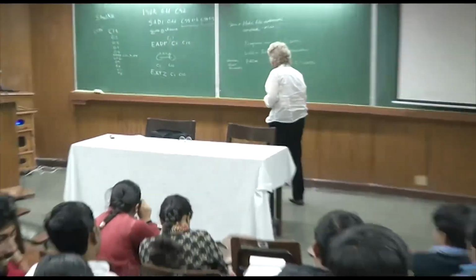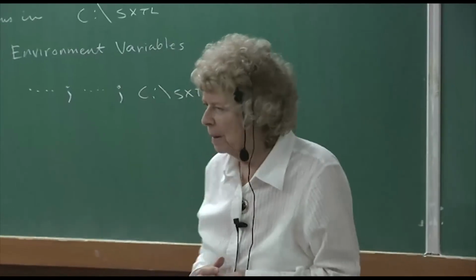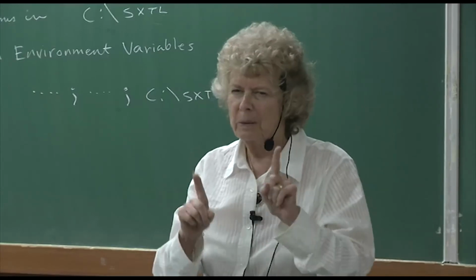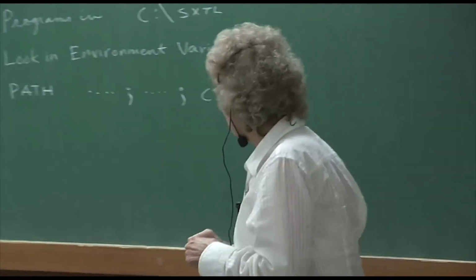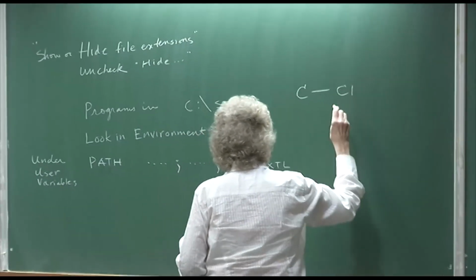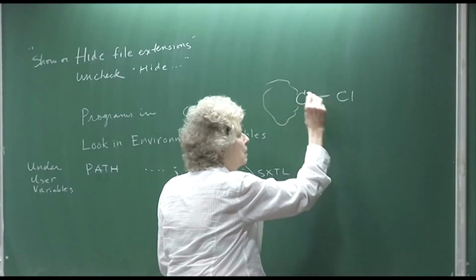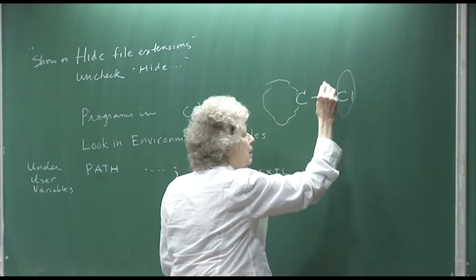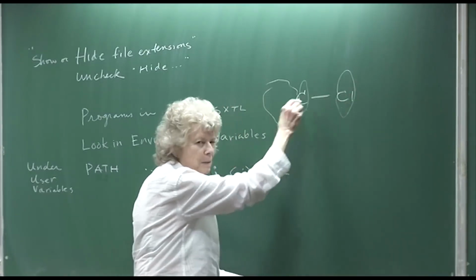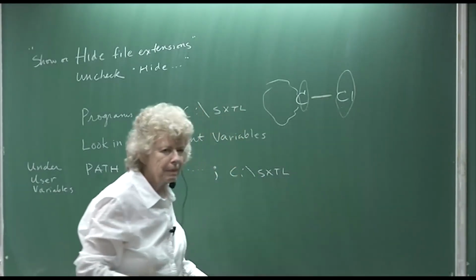Okay, Hirschfeld, yeah. So Hirschfeld was the first one to publish a paper describing the issue of the thermal ellipsoids being pointed at each other too much instead of being mutually perpendicular, which is the way they should be. Let's just look at a bond, like, again, CCl. And then there's something else out here. But this is a terminal chlorine. But you expect that this thermal ellipsoid will be like this one, and this one will be a little bit smaller. So this one is wagging a little bit more than this one, but they're both wagging perpendicular to the bond. And that's the complaint.